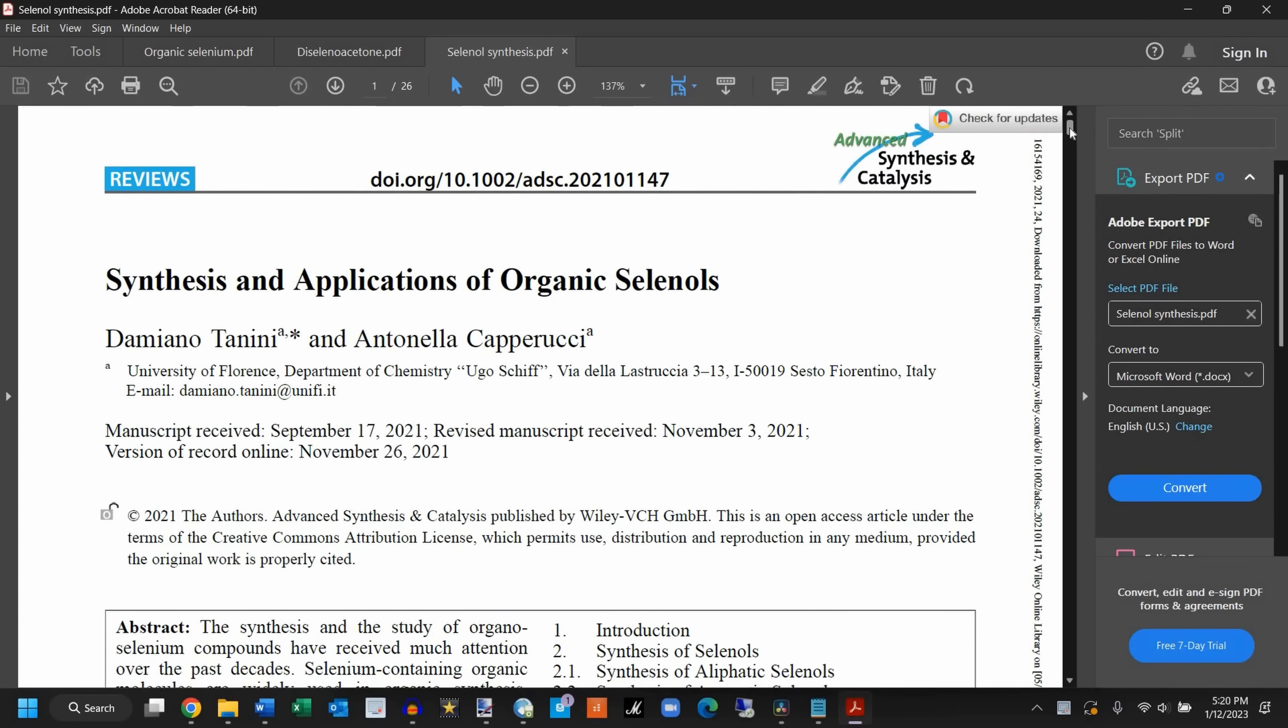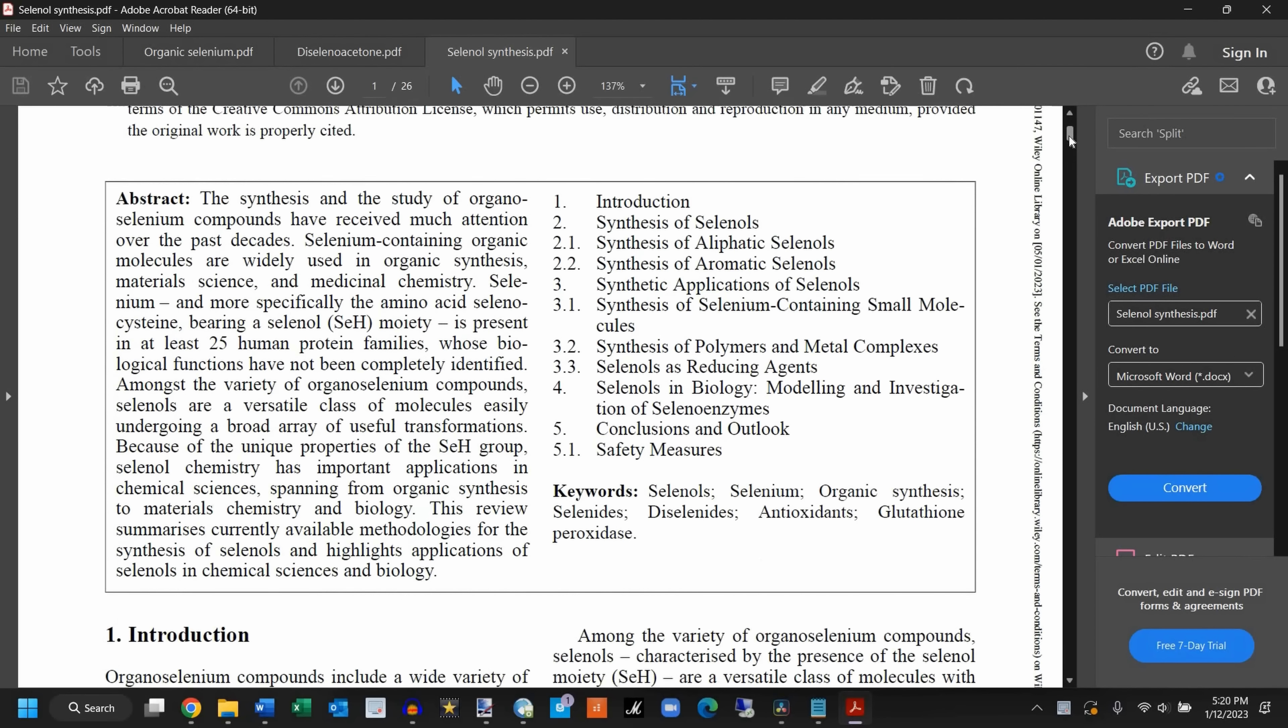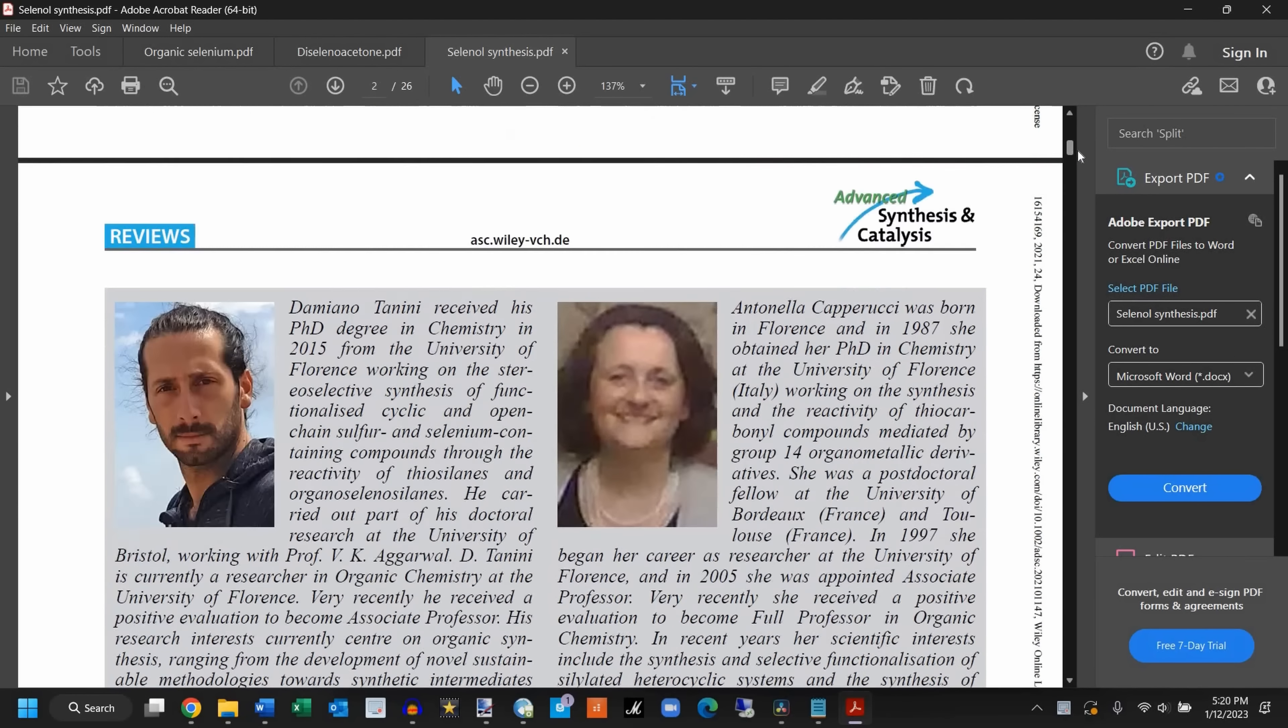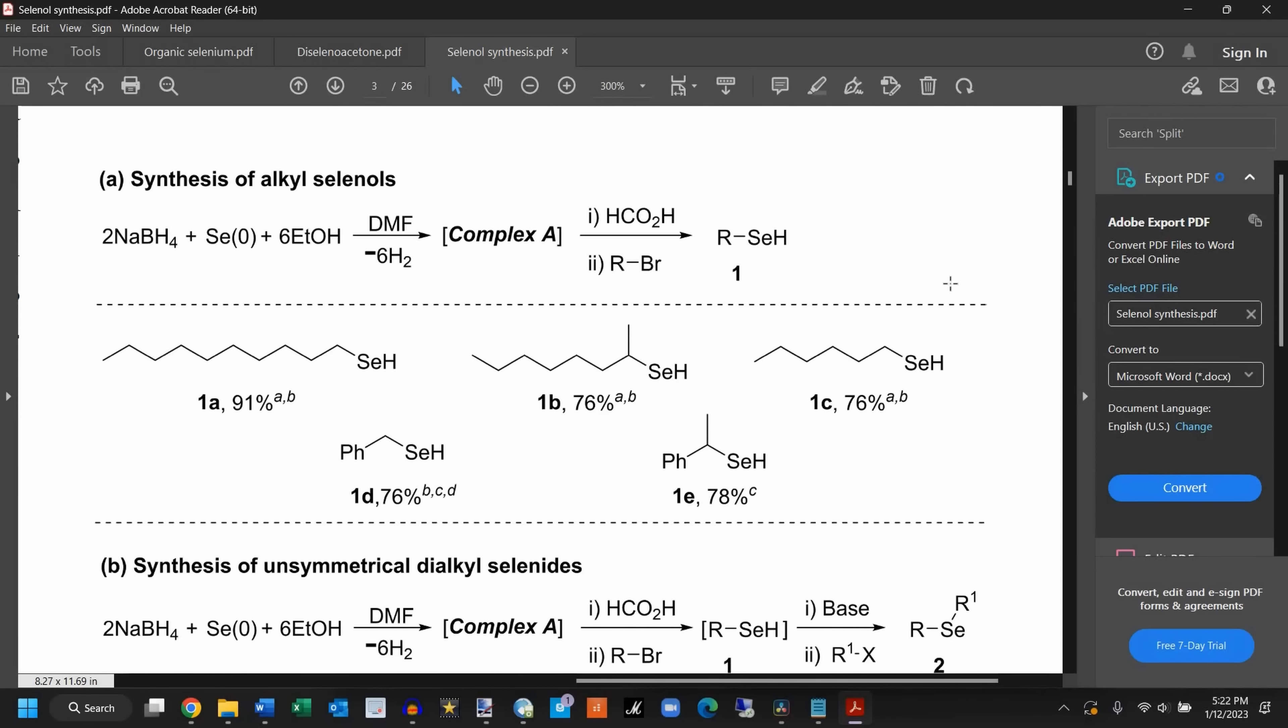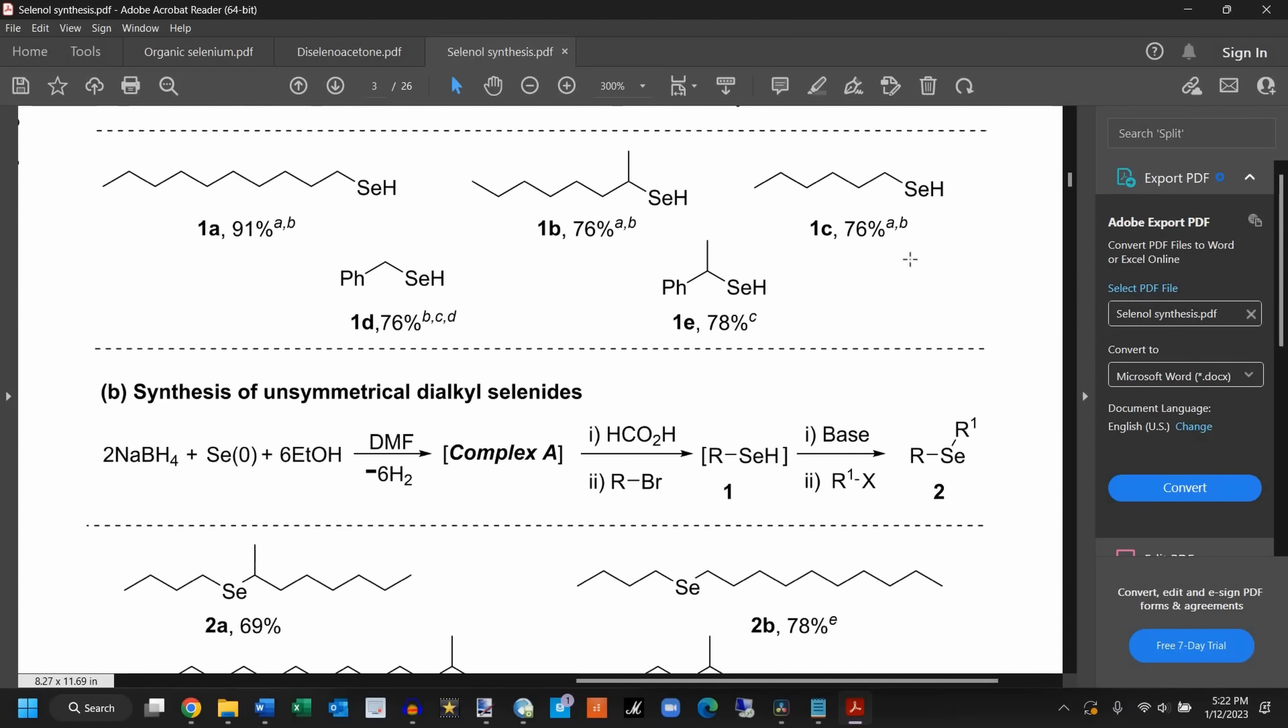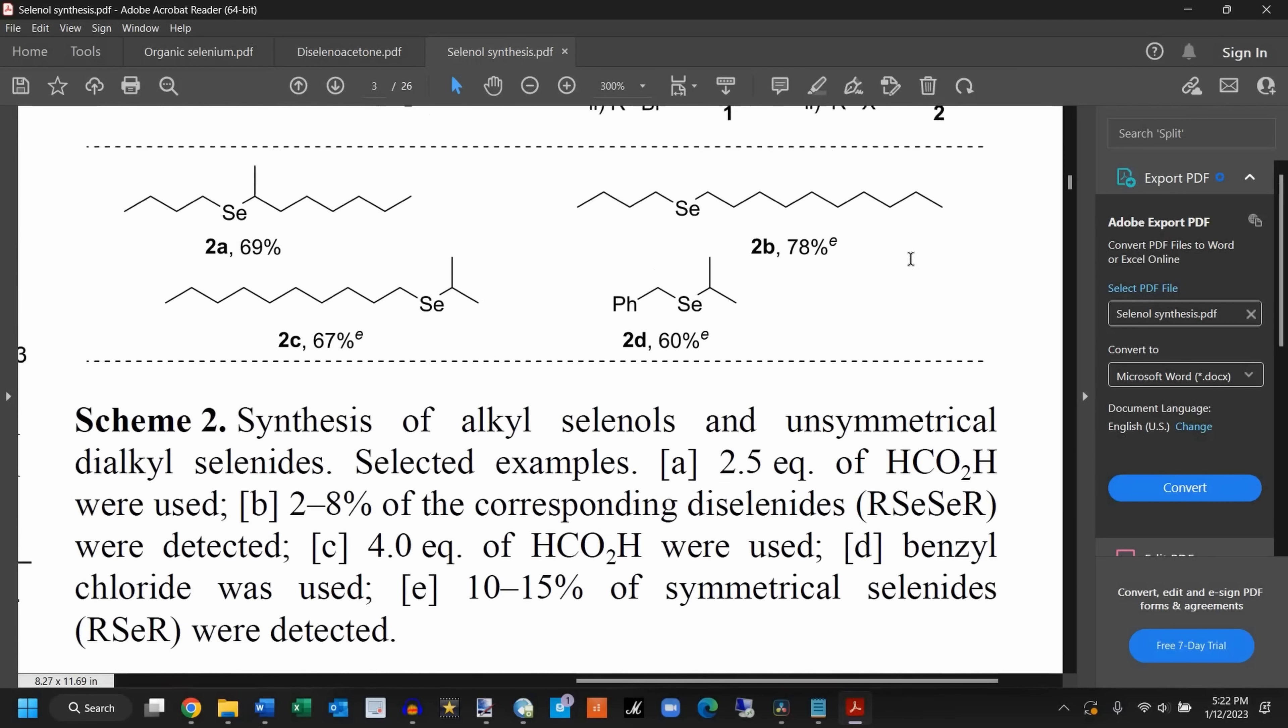To synthesize my selenols, I followed the procedure detailed by this paper, which was written fairly recently in late 2021. Basically, it entails mixing elemental selenium with sodium borohydride in an ice-cold ethanol solution, and then adding an alkyl halide and an acid to get the target selenol, which typically appears as a clear liquid that can be solvent extracted with something like chloroform.